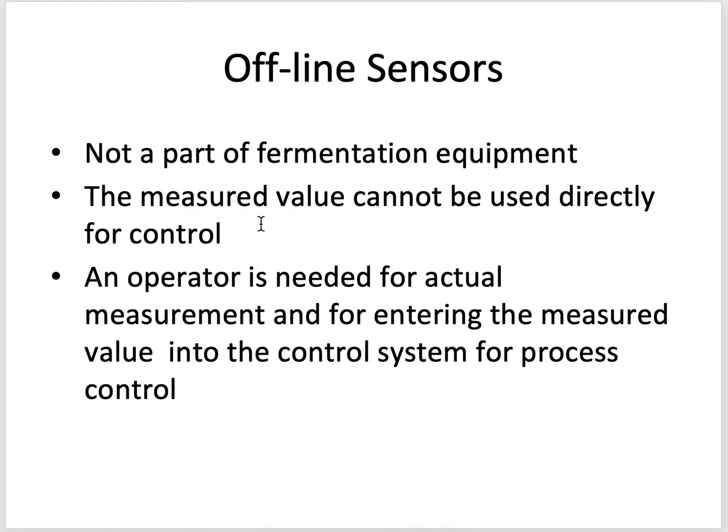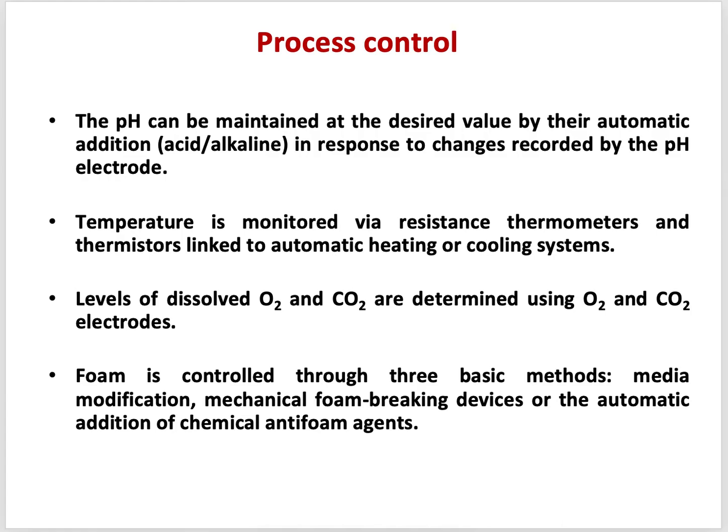Okay, so this was about sensors. Now I'll talk about process control. Control of different processes of the fermentation.